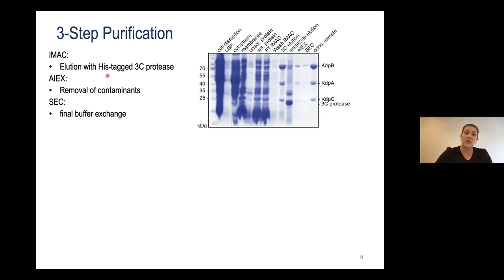One nice thing is that because the 3C protease itself is actually His-tagged, it remains bound to the column. I actually added 2 column volumes of buffer and the protease directly to the beads, just had that stirring for a certain amount of time, and eluted only the protein while the protease stayed on the beads, as you can see here in the imidazole elution.